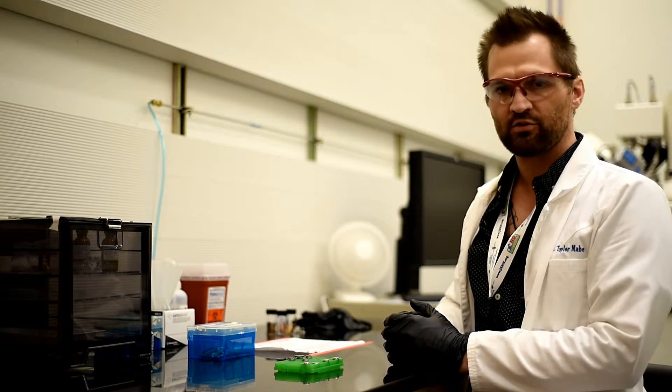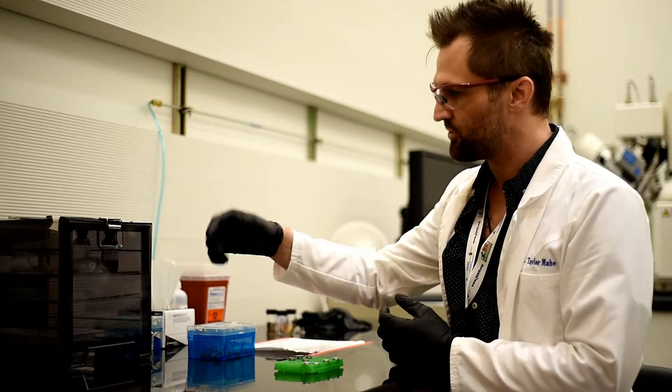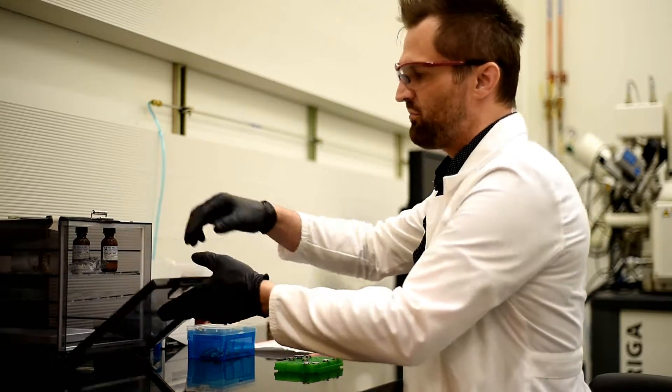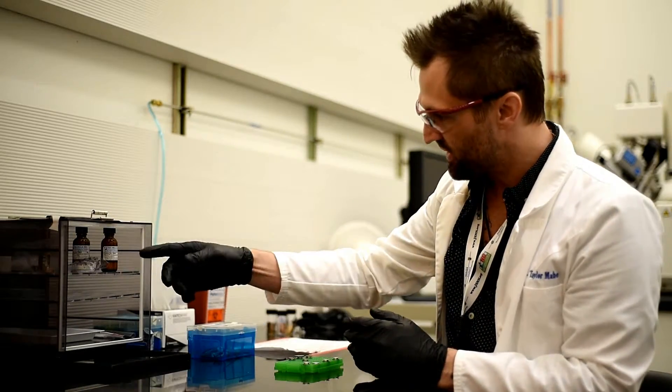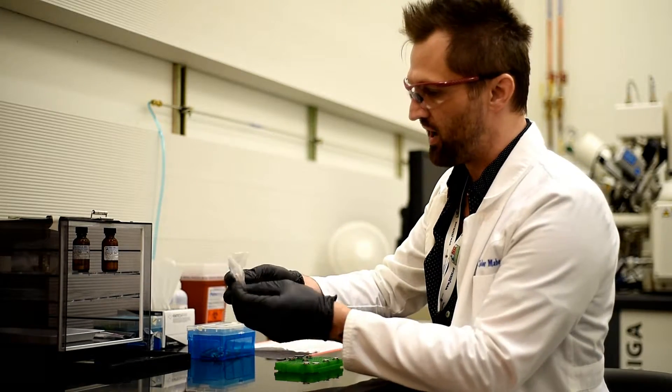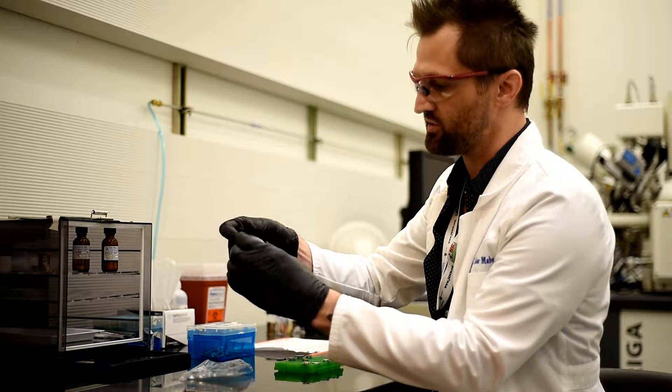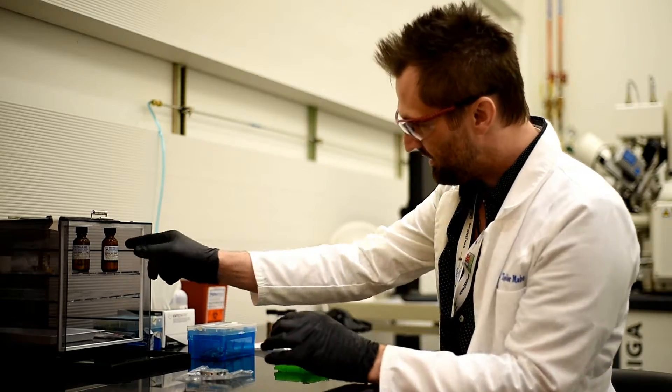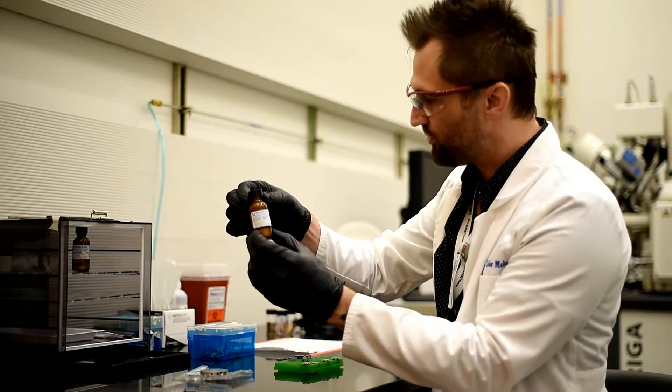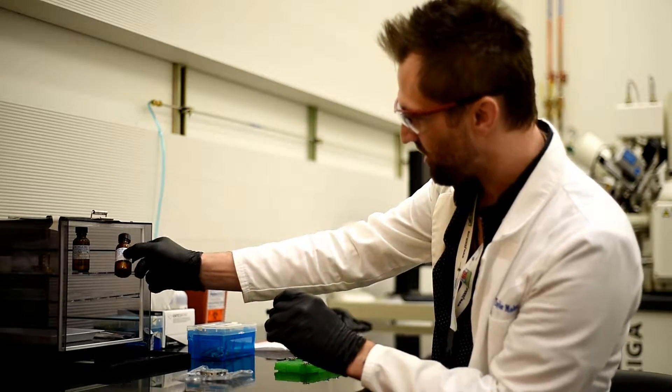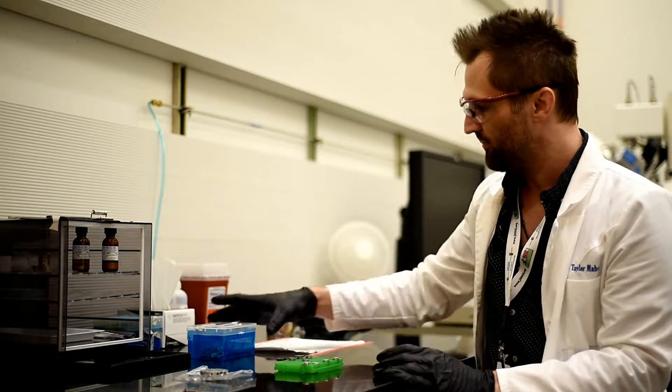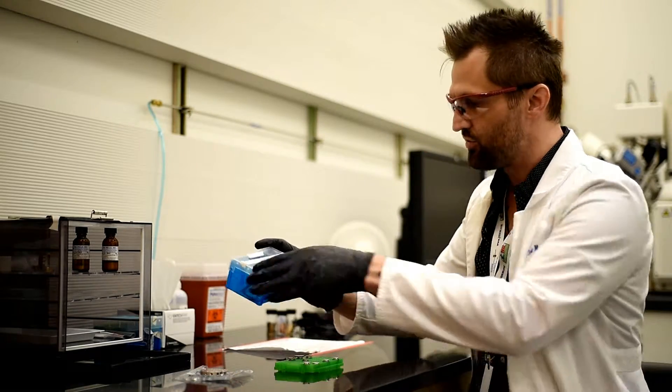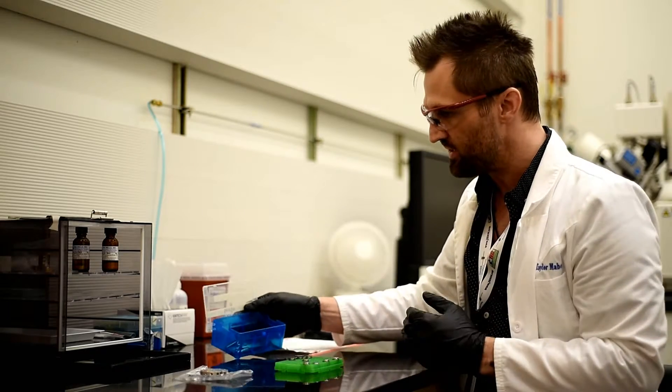For the scanning electron microscope, there's a desiccator which holds the three or four various sample holders that we have. The most popular one is this one here, which is a nine pin carousel, and things like silver glue and sometimes carbon tape.